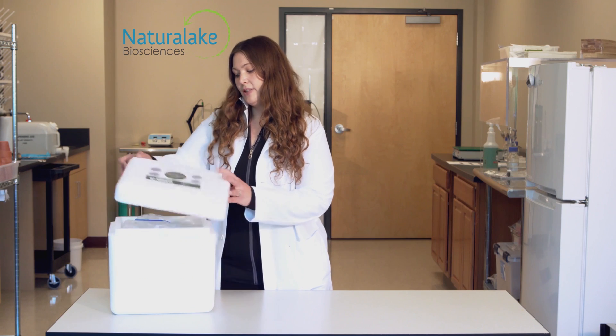We are here to show you how to properly send in a sample with our test kit. Included in this kit, you will find the following.